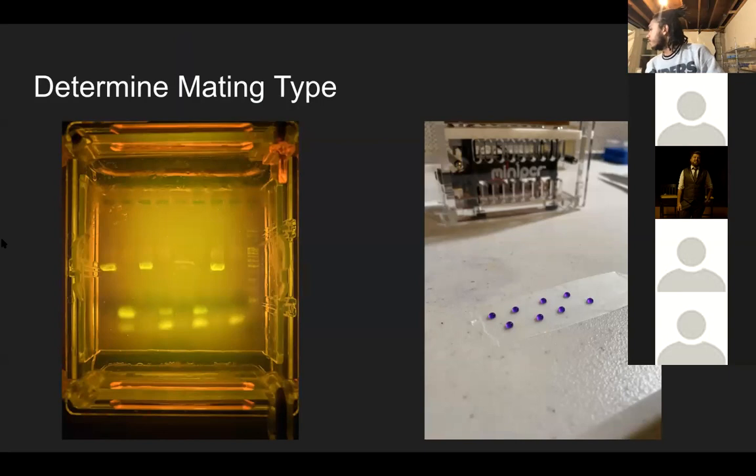My scope is a Microlux. Just get any kind of compound microscope. They all should have similar magnifications if you get a compound. I don't really have any scope recommendations though. I got this from a college auction.